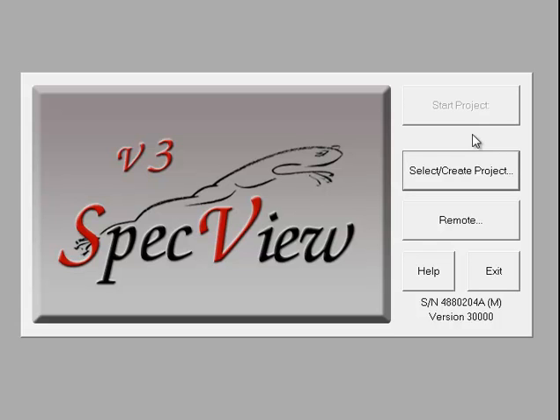When you start SpecView, this button shows you which project was last being used, and clicking the button will take you straight online to that project. In this case, it is the first use, so it is blank. To start our new project, click Select Create Project.